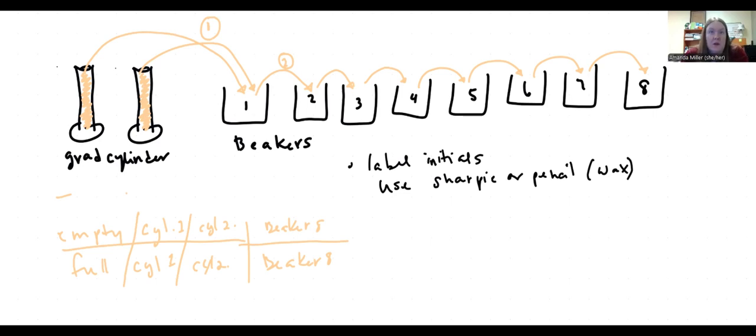If I take the amount we lose and divide it by 8, that will give me transfer loss per transfer. Okay, this is something we can refer to in every experiment where we have transferred material, which is going to be most of them. You'll have a quantity that you can refer back to from this experiment. Okay, so that is the transfer loss portion of part A. Once we're done with that, we're going to move on to a cleaning experiment.